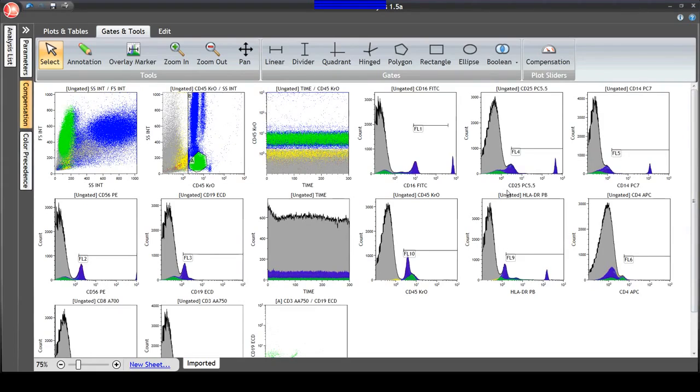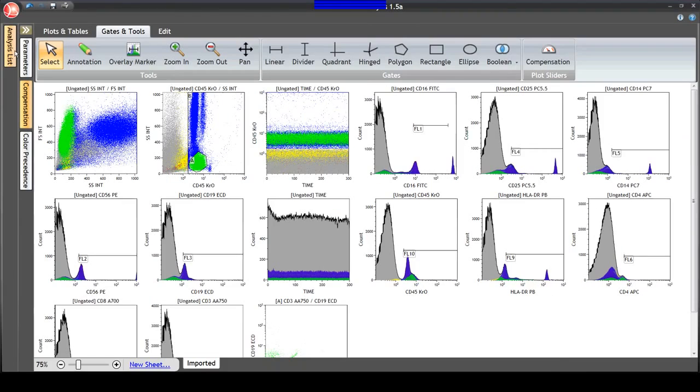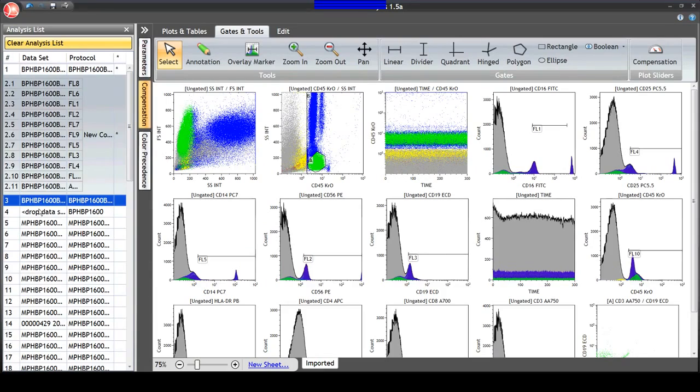All right. Not a lot of boxes to populate before I move on to the next sample, but all the information I need to see in order to know if the sample was prepared properly, lysed properly, and is running correctly. All of that data is collected uncompensated because that's another process that the instrument must do while it's running and acquiring that I don't need it to be doing. So my data is collected ungated and uncompensated.